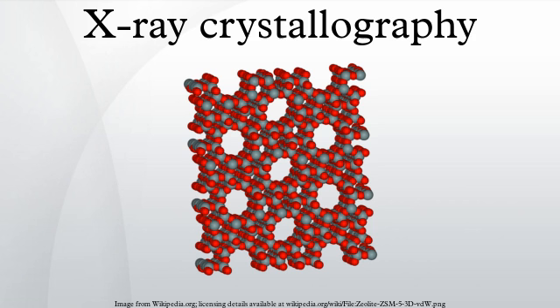Electron and neutron diffraction. Other particles, such as electrons and neutrons, may be used to produce a diffraction pattern. Although electron, neutron, and X-ray scattering are based on different physical processes, the resulting diffraction patterns are analyzed using the same coherent diffraction imaging techniques. As derived below, the electron density within the crystal and the diffraction patterns are related by a simple mathematical method, the Fourier transform, which allows the density to be calculated relatively easily from the patterns.